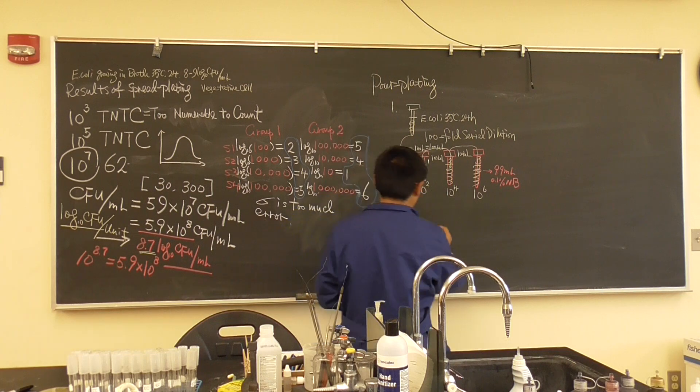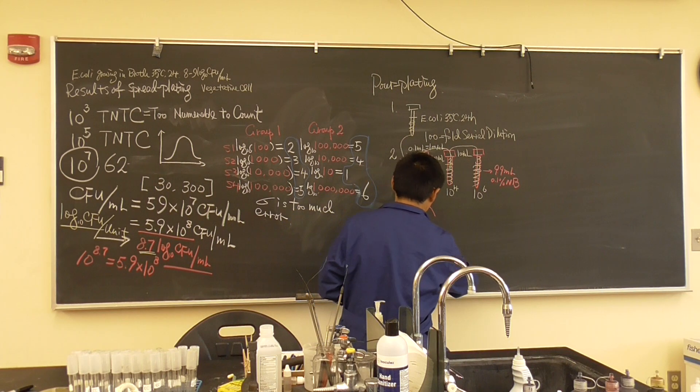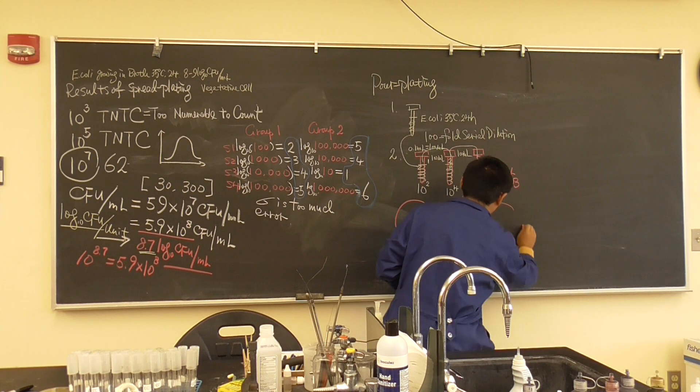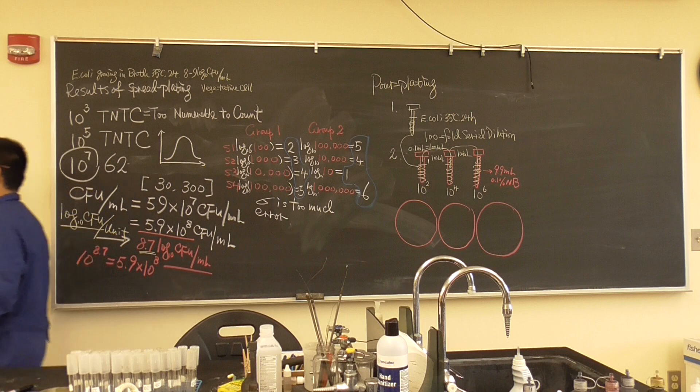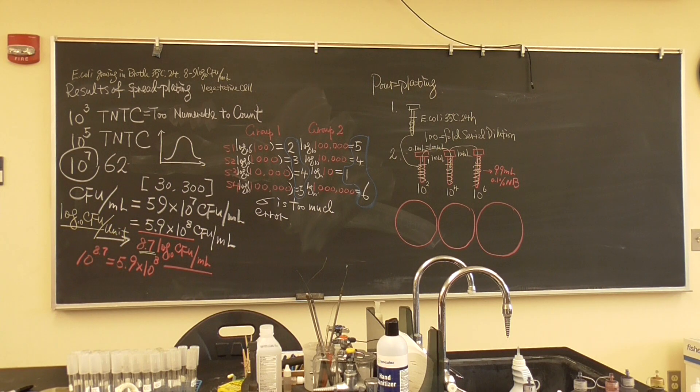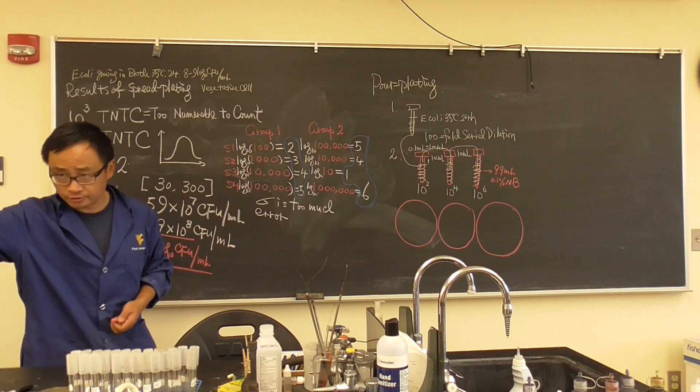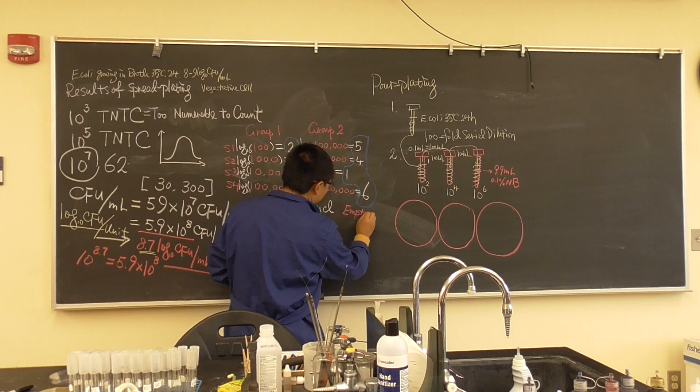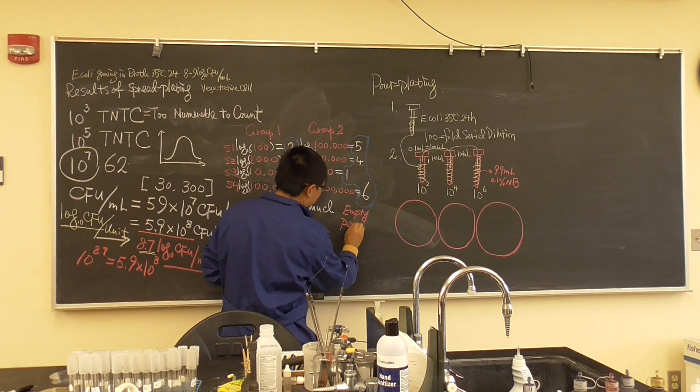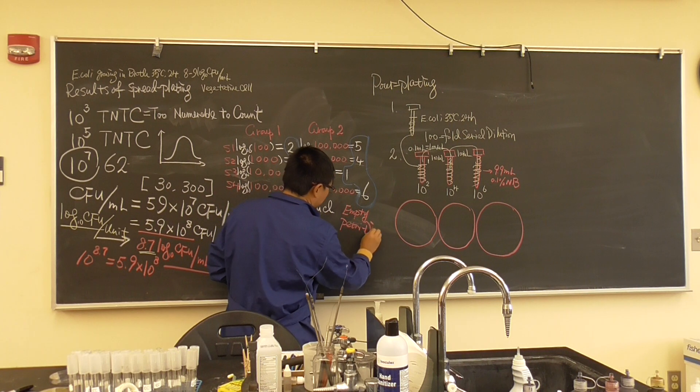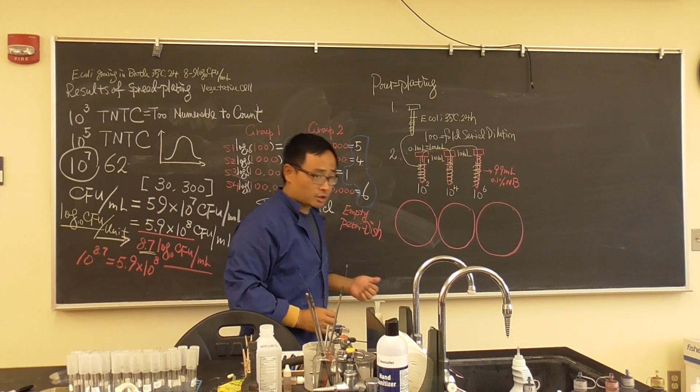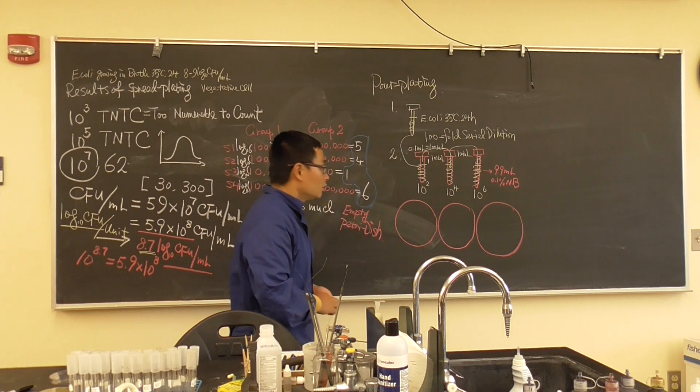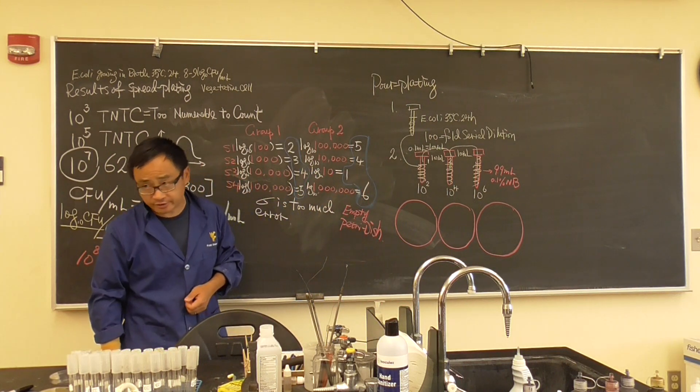Now it's something different. Instead of you get agar plates, what you're going to get today is empty petri dish. This is empty petri dish. These three are empty petri dishes. Because we're going to add the bacteria culture there, we're going to add a melted agar. Of course, the first thing, don't forget, is labeling.